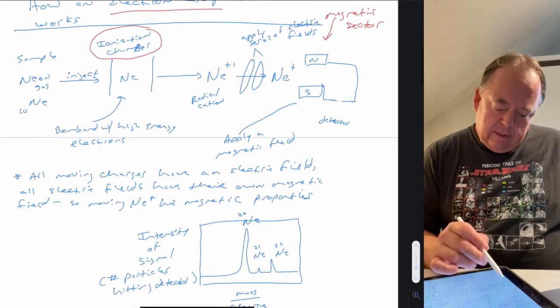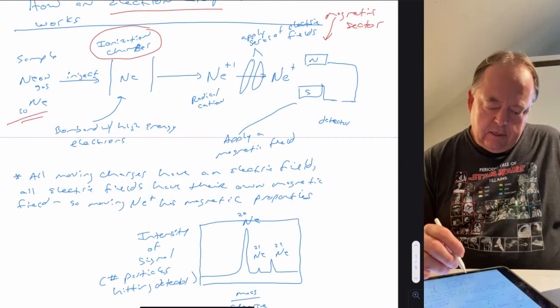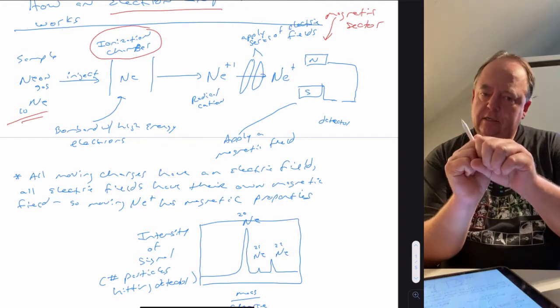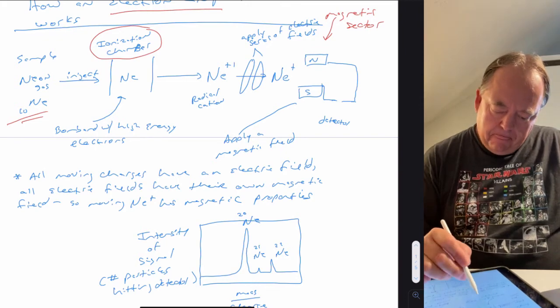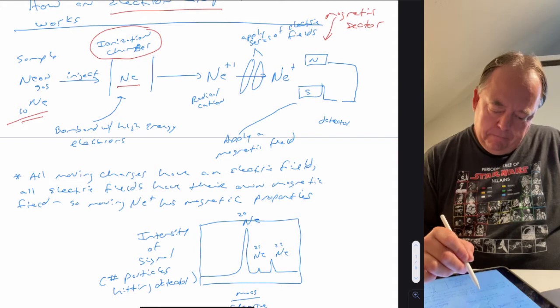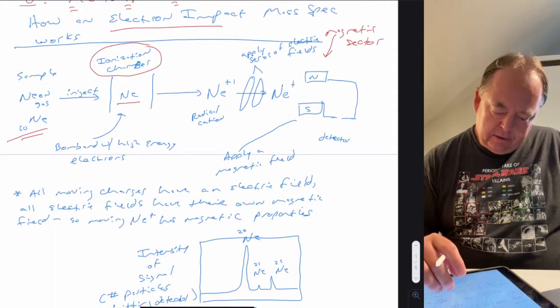Okay, so if we take as a sample neon gas from nature, neon has 10 electrons. What you do is take a syringe, draw some neon gas, and inject it into the mass spectrometer, and it first goes into an ionization chamber. This is an electron impact ionization method, and that's exactly what it means.